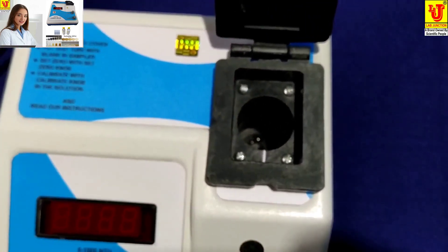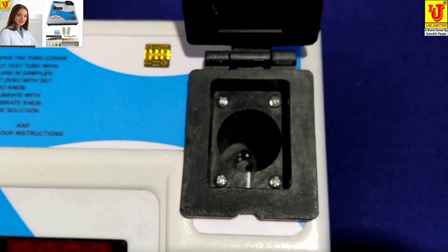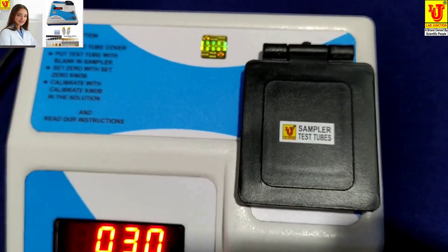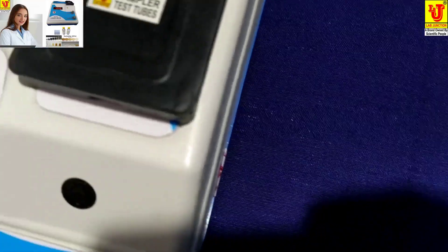Test tube size is 30 mm diameter and capacity 30 ml. Now I am switching on the main machine. Now these are the side views.